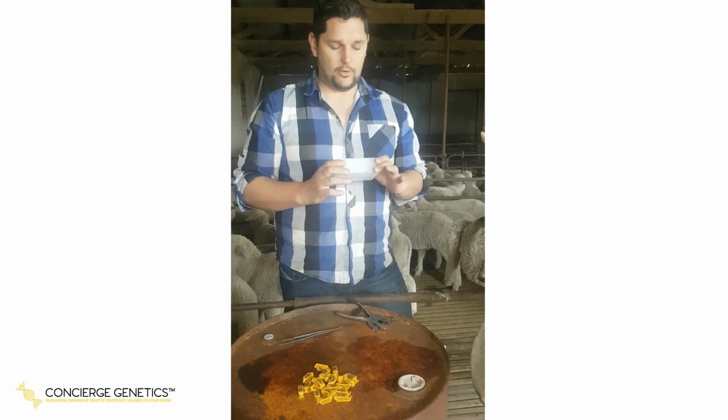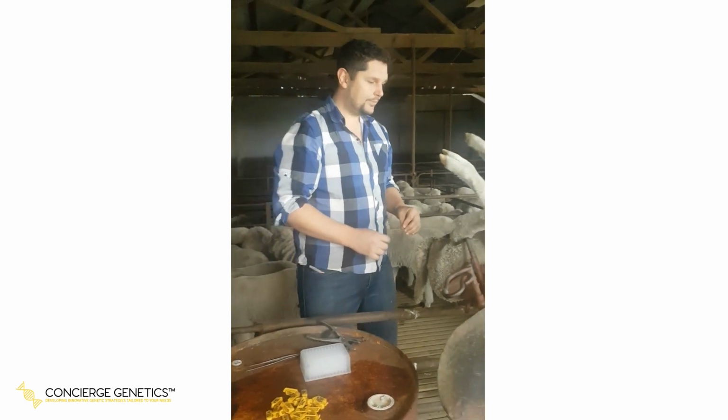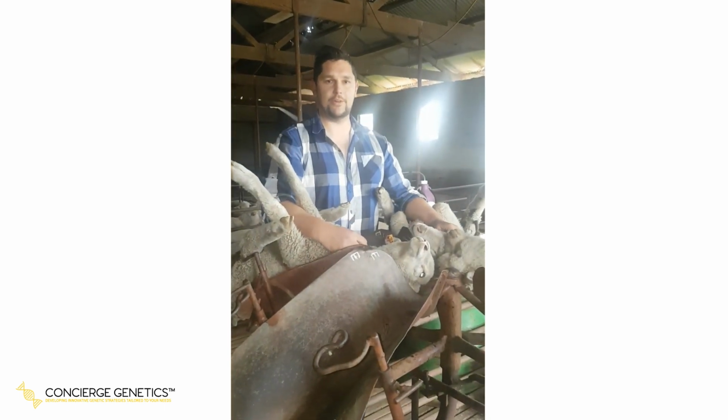So after you've actually filled up this plate with samples, you put it in a cool spot, maybe in the fridge, and then you just send it back to me in the lab and we'll do the testing for you.